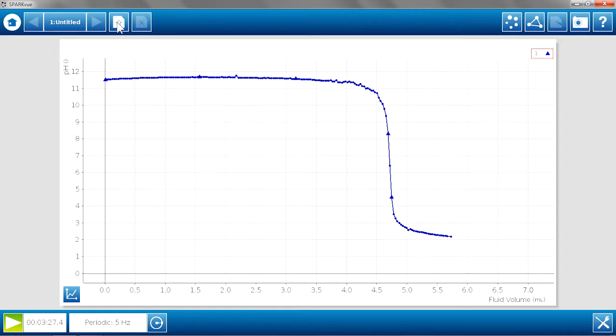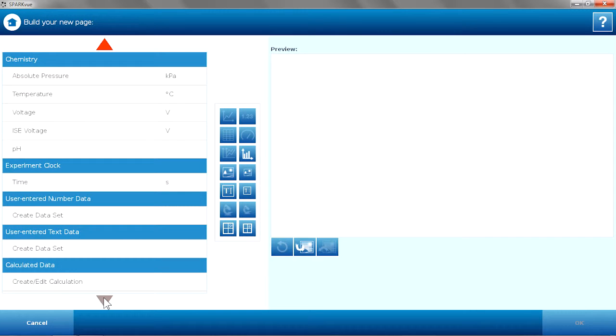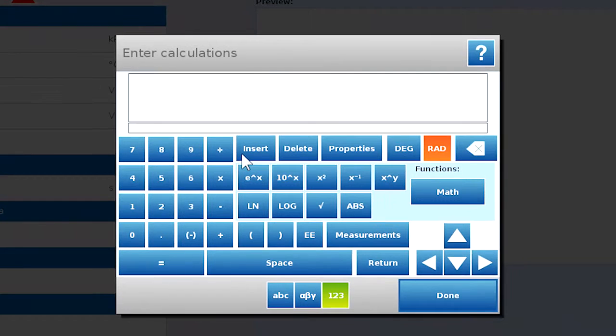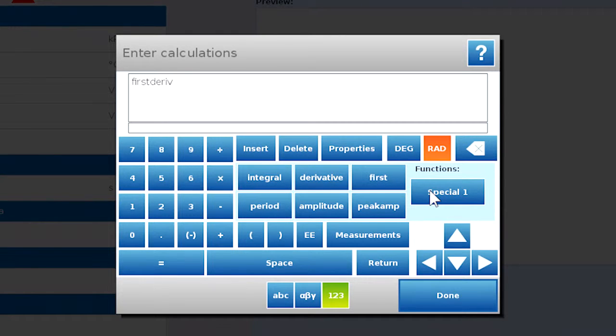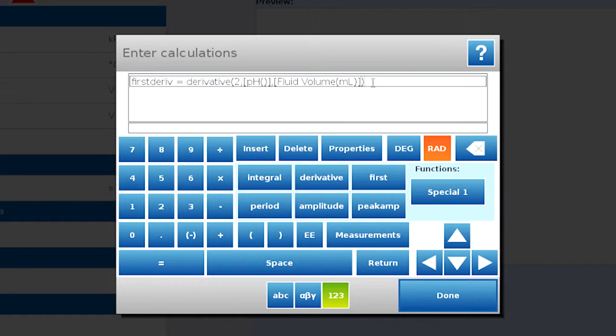One great way to analyze a titration is to look at the second derivative. So I'm actually going to build a new graph that includes the second derivative of the pH. I'm going to build a page, go to calculated data, and I'm going to do my first derivative with one of the math functions. And it's going to be a derivative of my measurement of pH versus fluid volume.